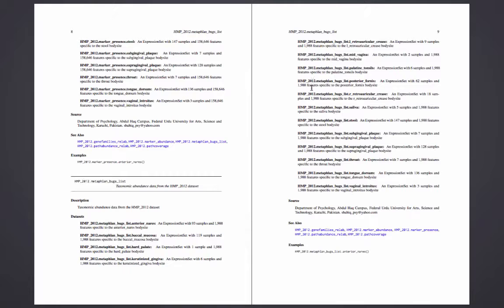And calling this function will return an expression set providing this dataset.